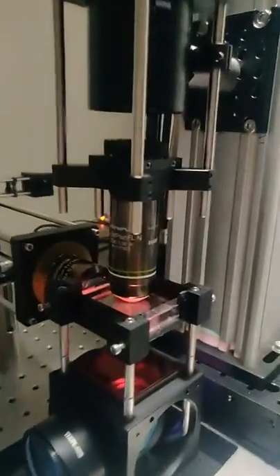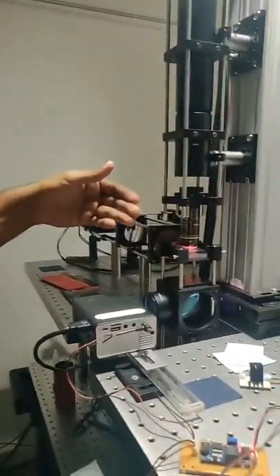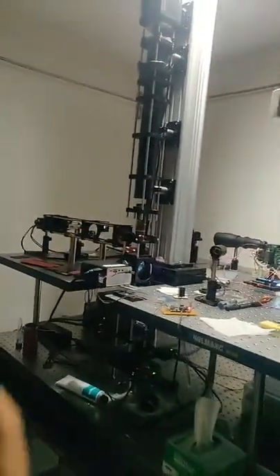So they are really small. So right now we are seeing the fish, it's actually a larva, right? It is a larva. It's alive. Okay, it's alive. And where is it? It's swimming in some medium, right? So I think Poonam showed you the restraint preparation where you fix the fish in agarose so it cannot move. The reason for that is because we have this microscope which is stationary, right? So we need the fish to be in this one spot.